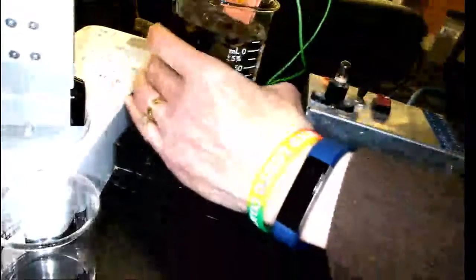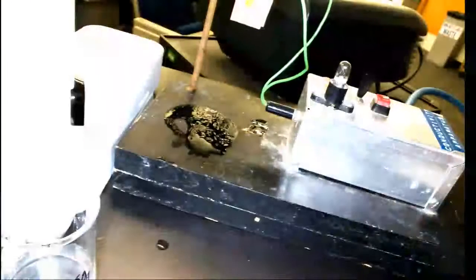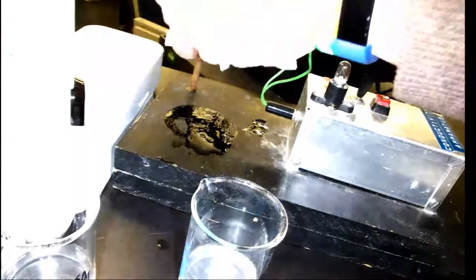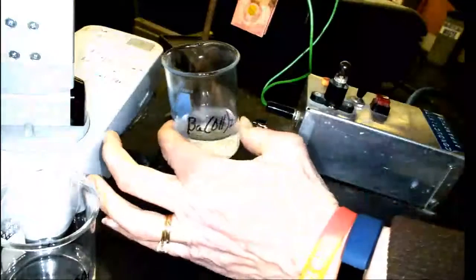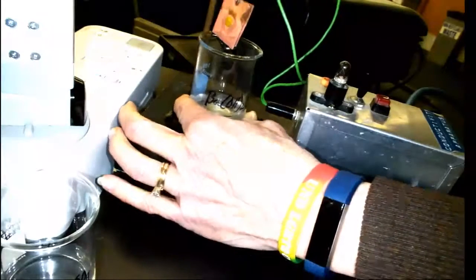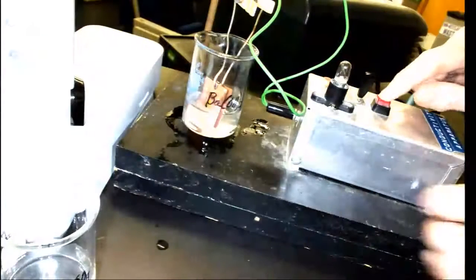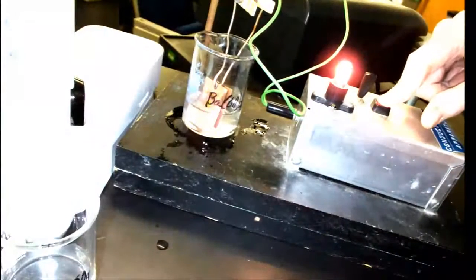Test solution number two is going to be barium hydroxide. I have a 0.1 molar solution of barium hydroxide. Again, I want to daub the extra liquid off because I don't need it. This solution says barium hydroxide, there you go. And we'll immerse the electrodes into the solution of barium hydroxide. My hand is out of the way, there we go. And flip the switch, and indeed, there is the presence of ions, the light bulb glows.